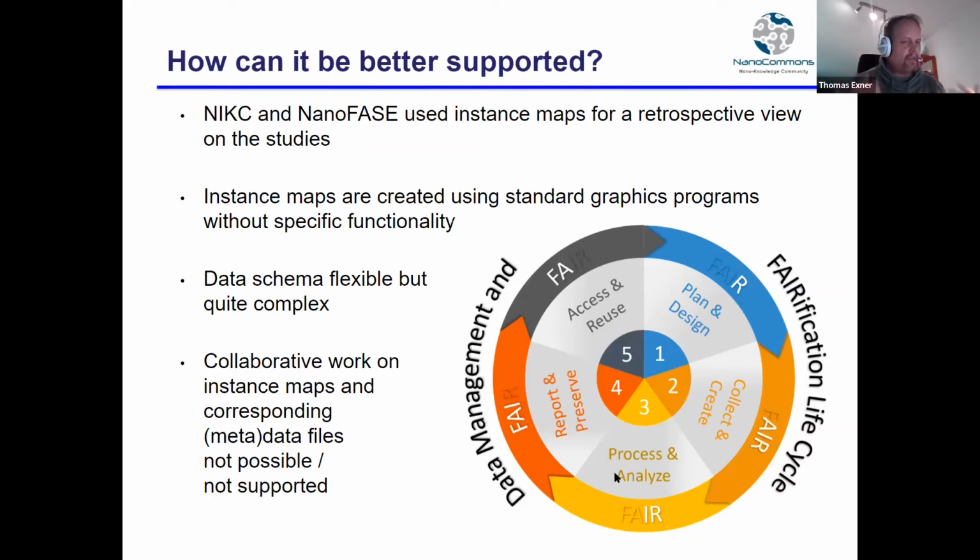You have these different steps, and each of these steps is actually producing some kind of metadata or data. Even the planning is already showing you what kind of experiments are needed, the collection, what protocols you want to use, and so on. Therefore there is a lot of data already produced at this stage, and it would be great if we could also collect these at that stage. And then the only collection here is really the experiment, more or less, but with a parallel data documentation.